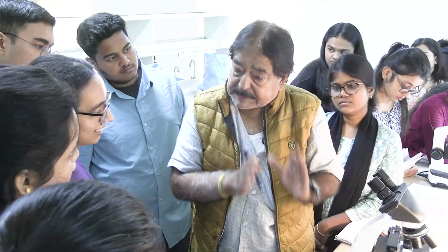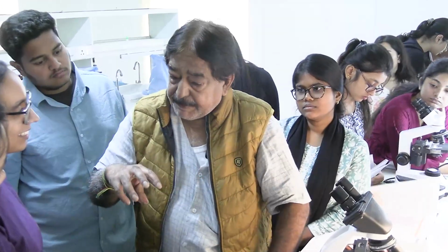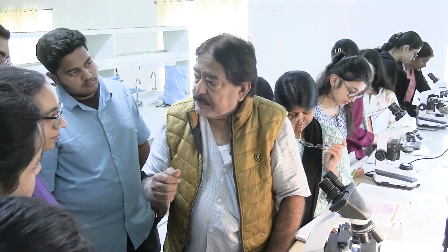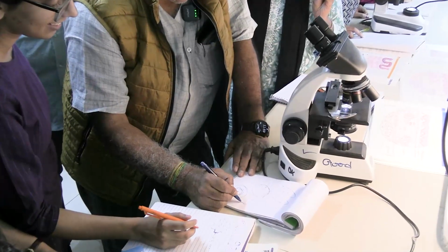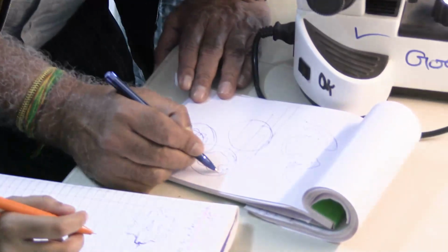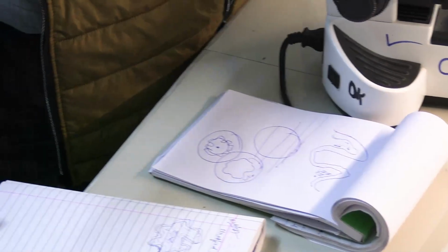Your tissue architecture, the microanatomy, is intact, but the main thing is that this has moved, that's why you are thinking like that. A tube is not such a rigid pipe. See, it is not a rigid pipe.